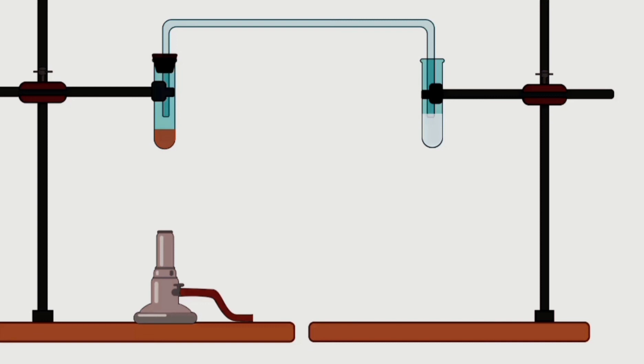This is a decomposition reaction. Zinc carbonate is decomposed into carbon dioxide and zinc oxide.